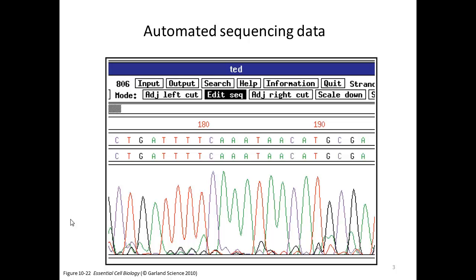And here you can see high quality sequence. It's easy from your eye to see which is the predominant color and therefore read out the bases. And you see here there's 4 T's in a row, simple to see. And you can see that in some places some of the background fluorescence from the other bases starts to be substantial.